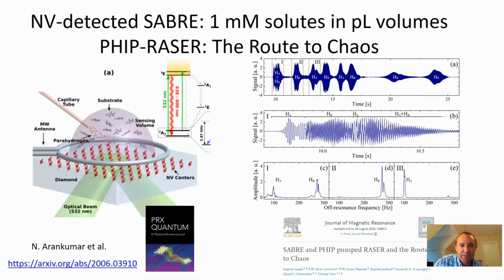And then you have funny things like intermittence effects, where first one of the spins in your spectrum will be observable, HB, and then it switches back to HA, back to HB, back to HA, back to HB. And look at this FID. It lasts for 25 seconds. These are really fascinating effects that I'm going to be detailing. And what is kind of crazy is that it's actually possible to understand them if you spend enough time thinking about these effects.